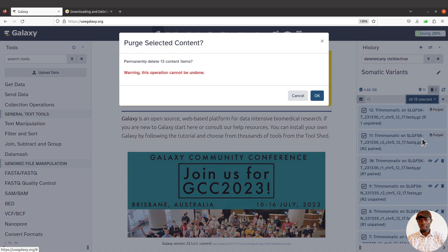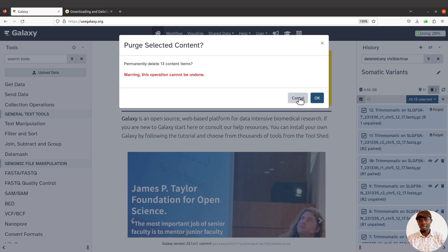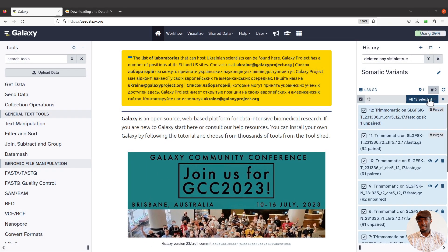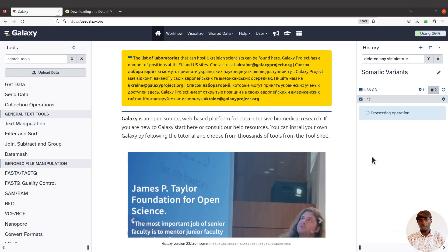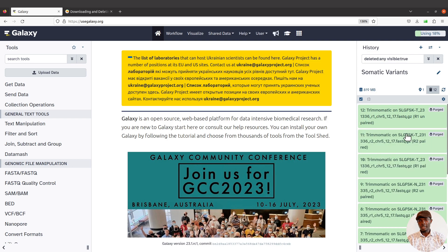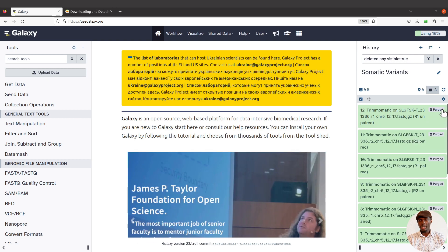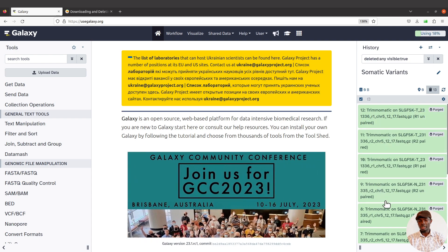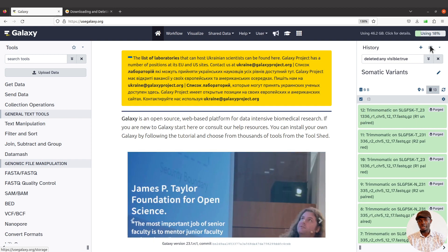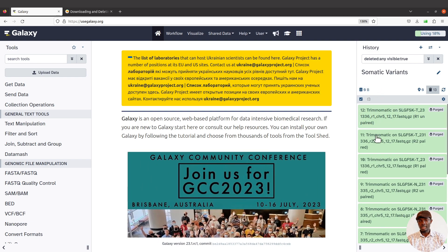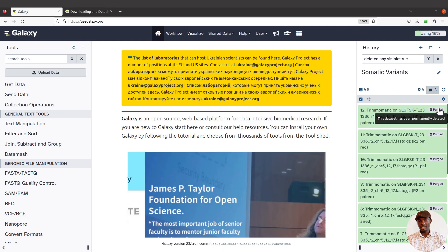When you come to 'Delete permanently' and click OK, the processing will be done and the files will be deleted. Once deleted, you'll find a label 'purged', which means they are gone and have been removed from disk. You'll notice the quota percentage drop — mine went from 20% down to 18% because the files were large. Now it shows zero bytes in this history, meaning everything is gone.